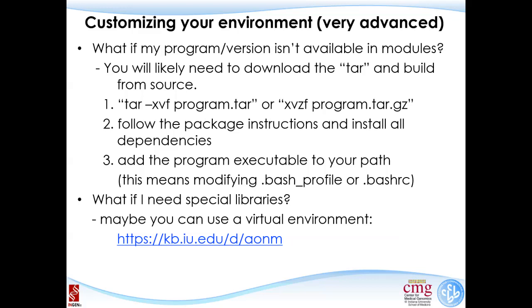So I'm not going to go through the steps for how to install these things. Like I said, you can find most of this stuff on Google. But you generally need to download what's called a tar file, which is basically the same thing as a zip file. You can follow the package instructions, but just be aware that you might have to install 4, 5, 6 packages to get this stuff to work. You'll also need to implement programming language environments that are specific to these tools. So if you're using a tool in Python, you might need to install libraries inside of Python, and that can get complicated.